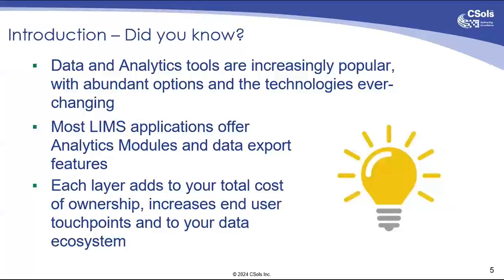Okay, now, so before we begin, you know that there are more data analytics tools becoming available on the market with newer technologies and a faster pace to get processes more efficient and decisions to be made. There has been a huge increase in interest in this particular area of computing. Now, as such, most modern top-tier LIMS vendors are listening and recognizing that data analytics within their products provides clients with internal options to visualize their own data.